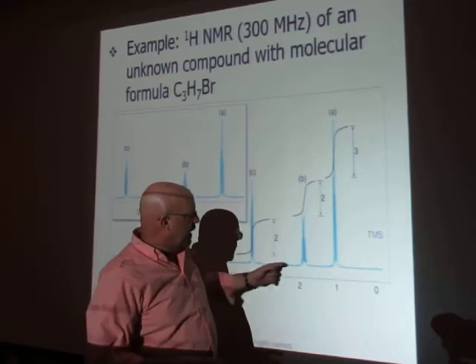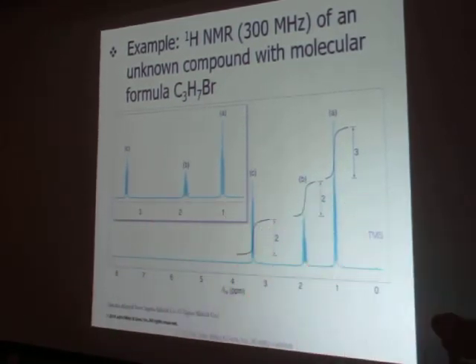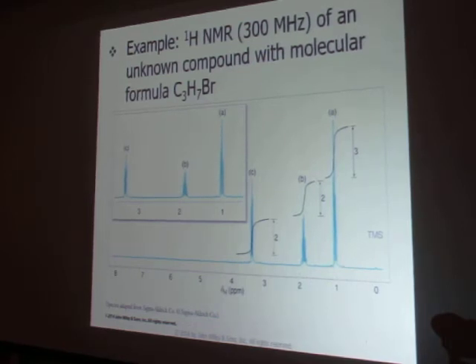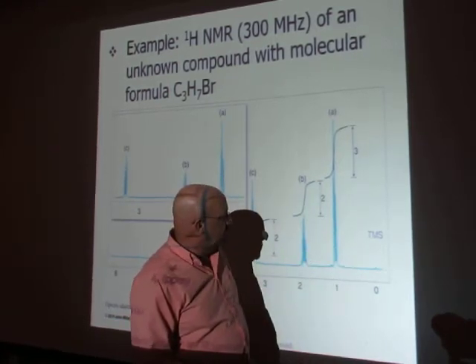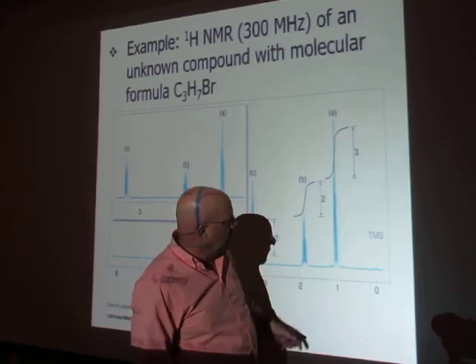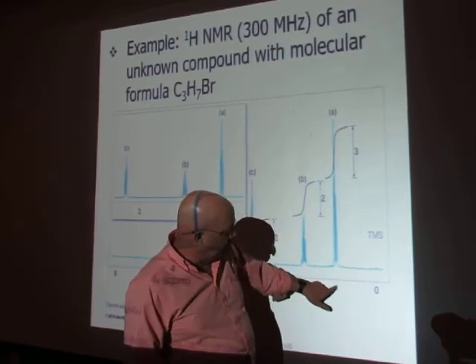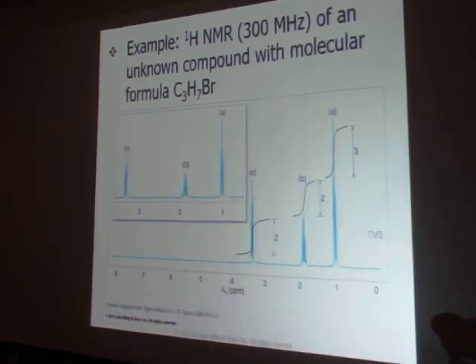That's a CH2, but my chemical shift, that didn't make sense, so I don't know what's around it, but let's just write that down. I got a CH2. I'll put a question mark for that. That one's kind of confusing to us at the moment because of the chemical shift. This one is a CH3. Normal alkane was what the shift told us, just a normal alkane proton. So CH3.